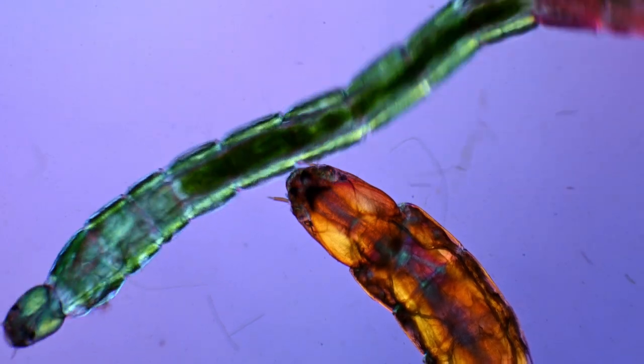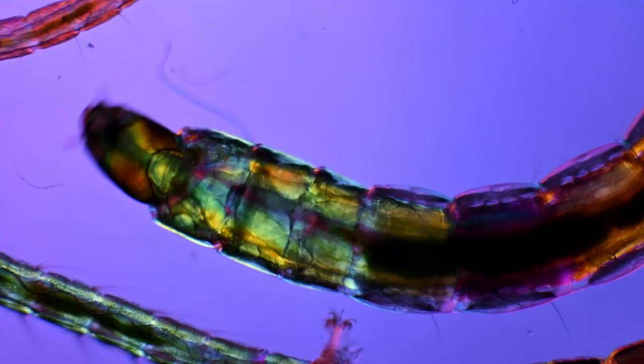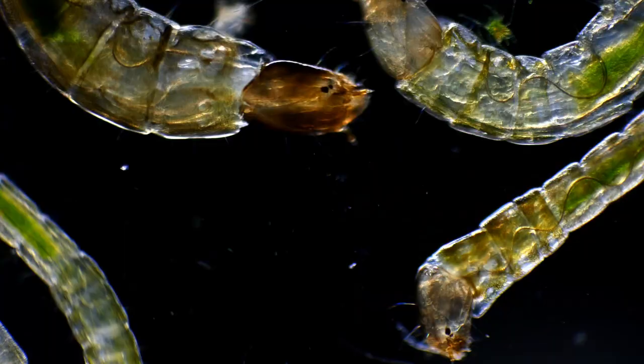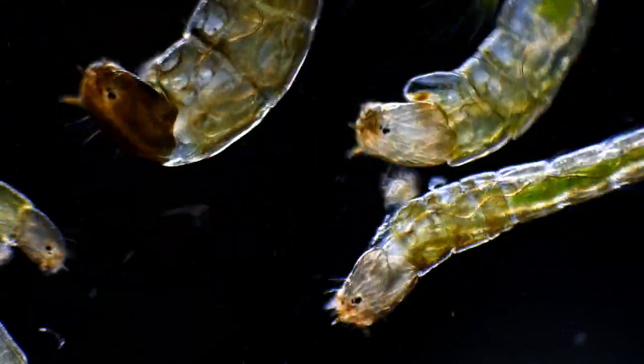The larvae of course use this wiggly motion for movement, but also to get new water around them to increase their oxygen absorption when oxygen levels in the water drop.